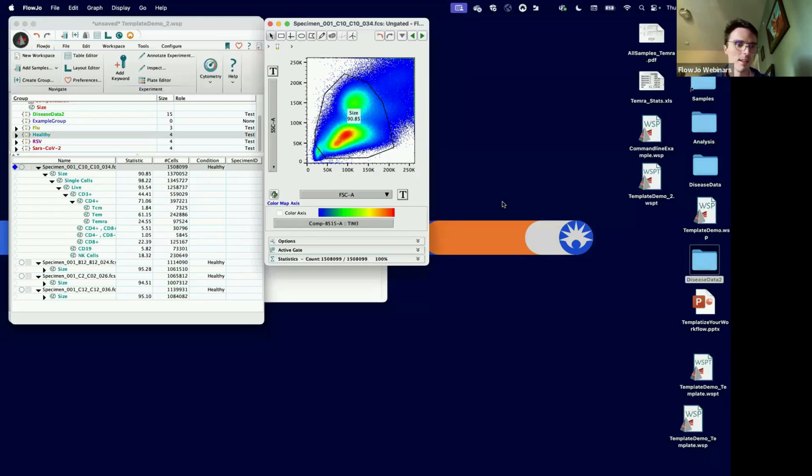I was doing it kind of fast because I didn't really care what the gates looked like, since I knew I wasn't necessarily going to be using this data for any reason. I was just using it for the demo. So I drew some kind of sloppy gates. This is a wide gate on my forward scatter and side scatter that I was using for the size inclusion. I included both these lymphocytes, like my T cells, B cells probably located down here, and then these larger cell types, which if I had to guess were probably my monocytes, maybe.